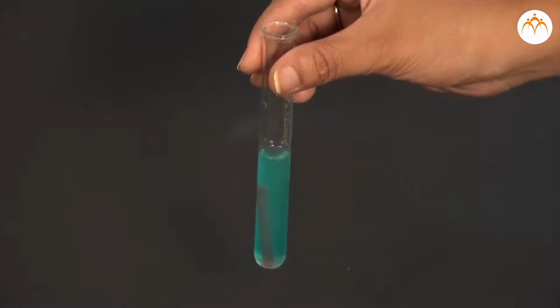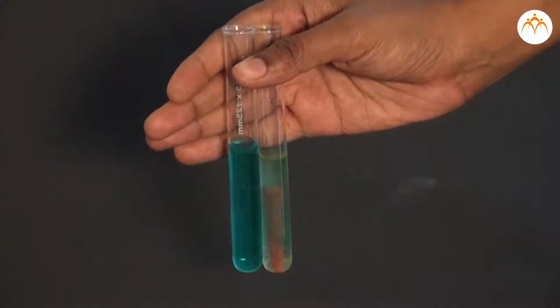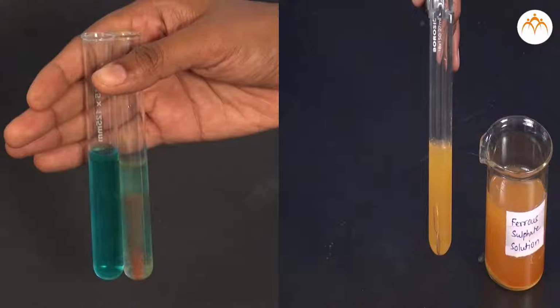Observe the reaction. The blue color of copper sulfate turns to green, and a copper coating is formed on the iron nail. The reaction is taking place in the first test tube, but in the second test tube there will not be any reaction between copper and iron sulfate solution.